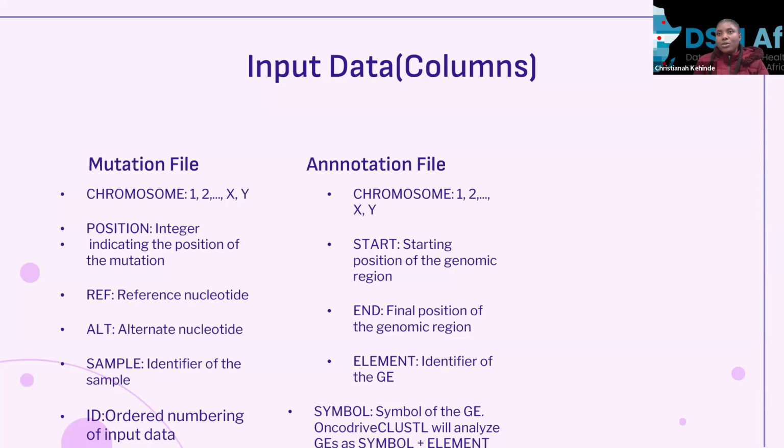My supervisor and I actually wrote a simple script to do that. And when you see the example file, you would understand what I mean. Okay, so other additional columns could include the cancer type. Maybe you're writing an article and you want to put that just to ensure everything is in order. You can also include that as an additional column, and also the signature.